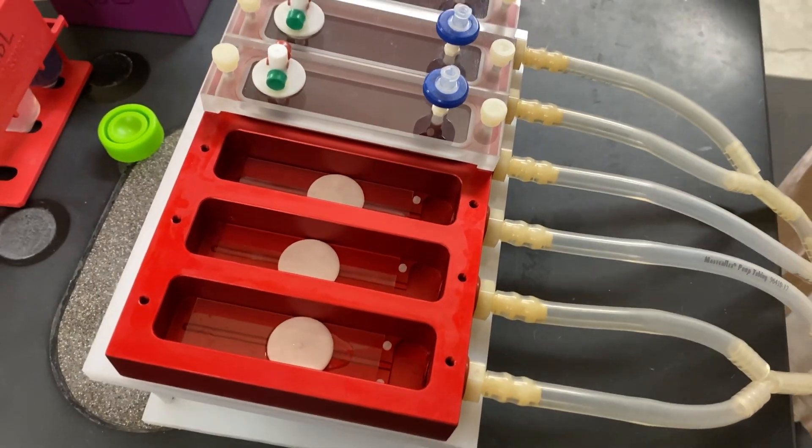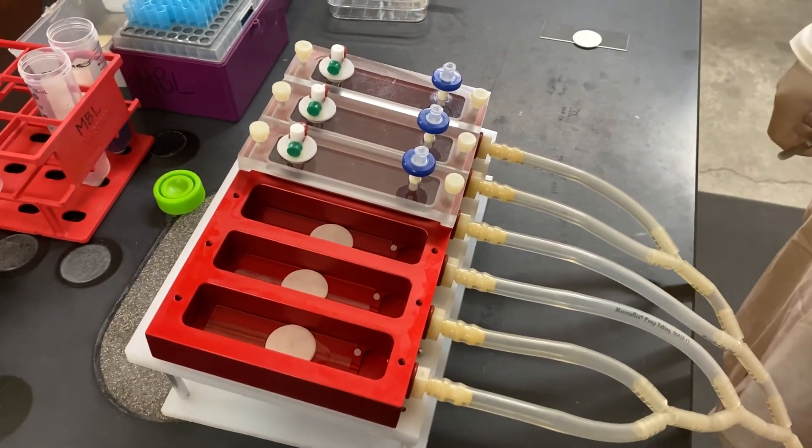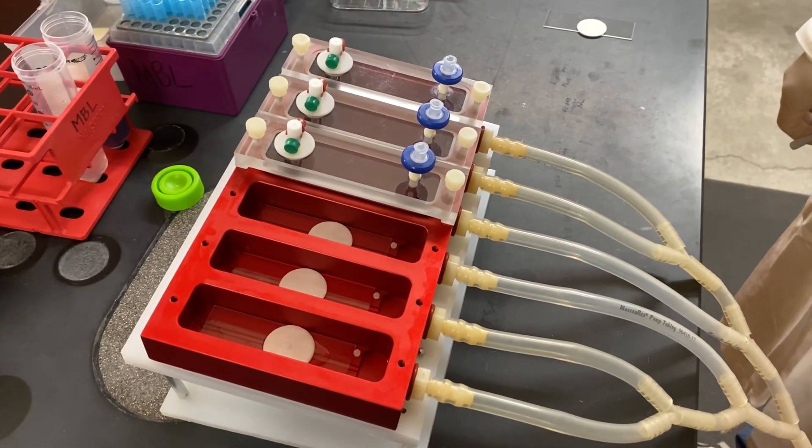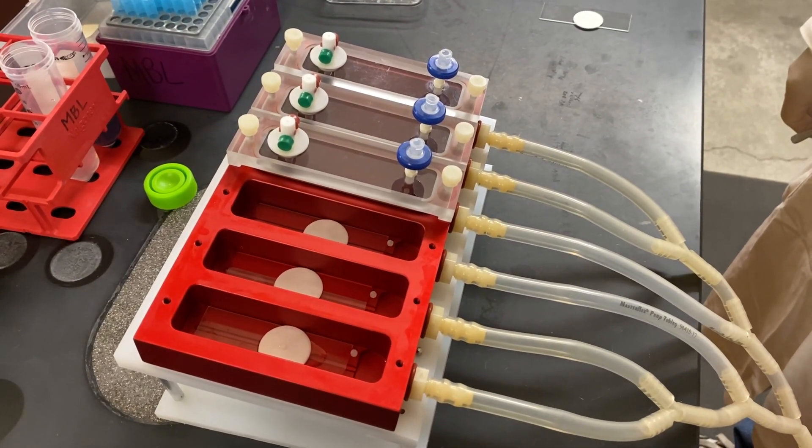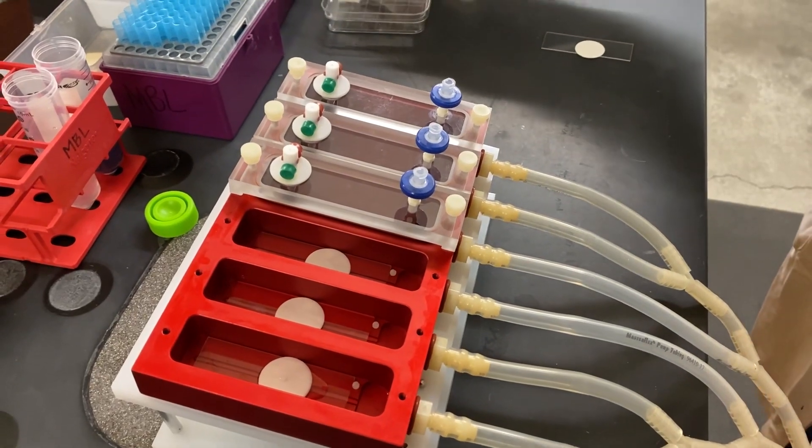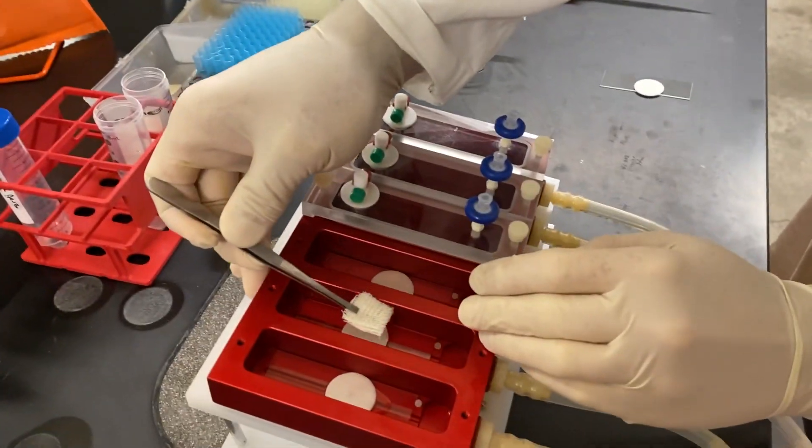This biofilm growth scheme is how we imagine a biofilm growing in a wound whereby it is fed from below in the wound bed. If we're testing a wound treatment or dressing, we would place it on the initial inoculum drop.